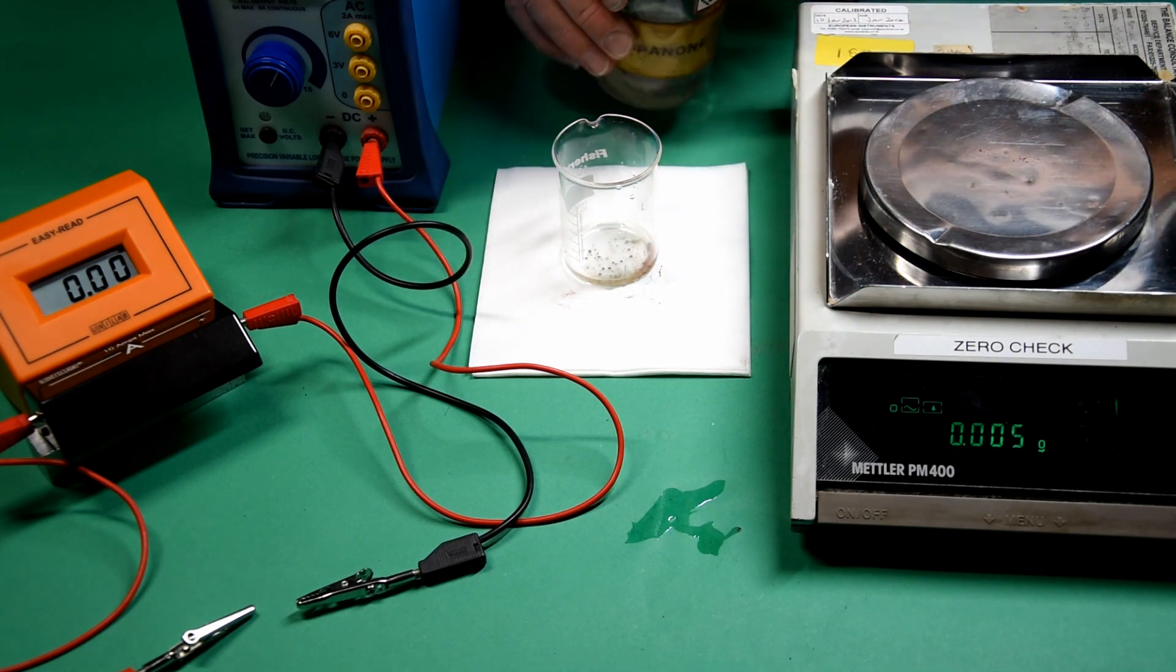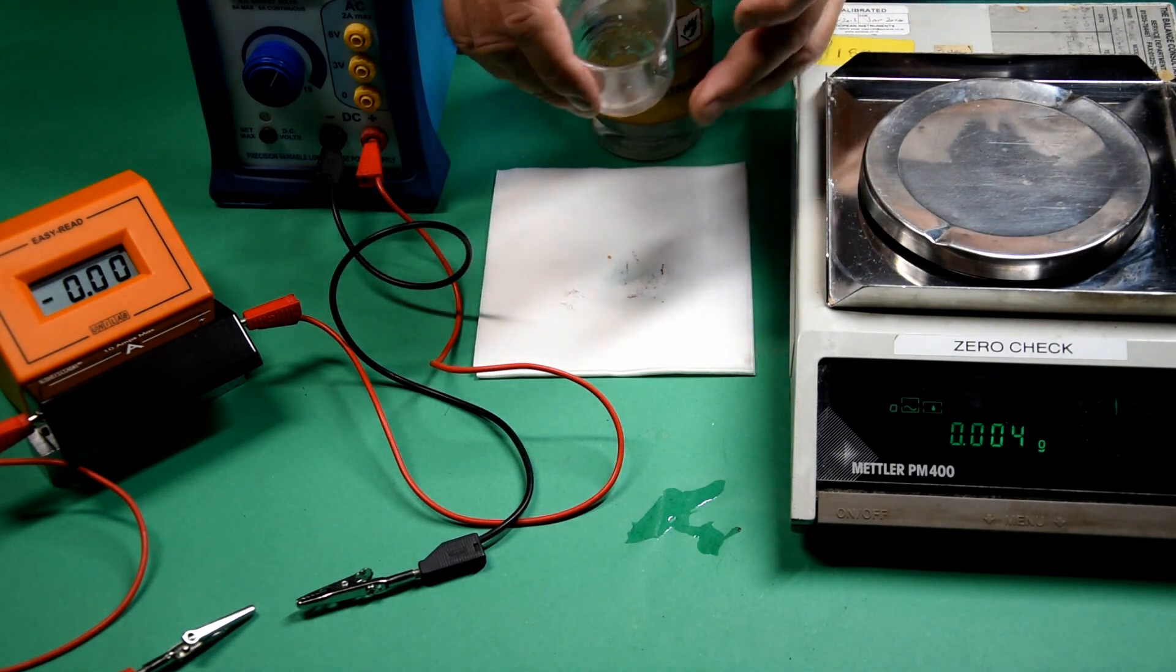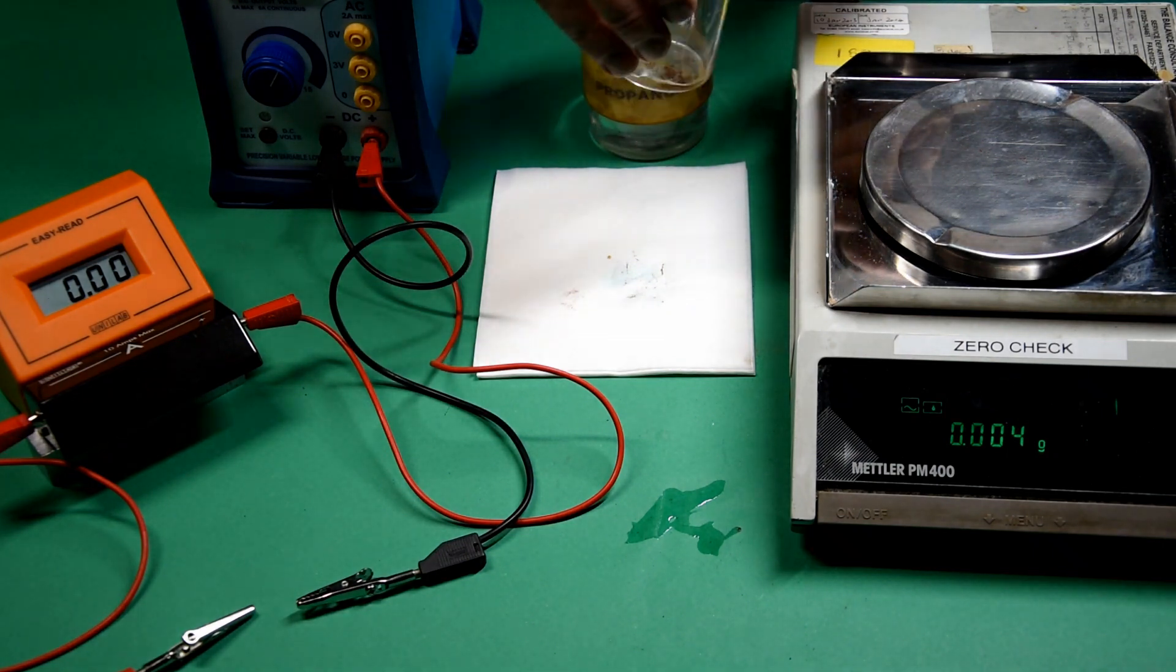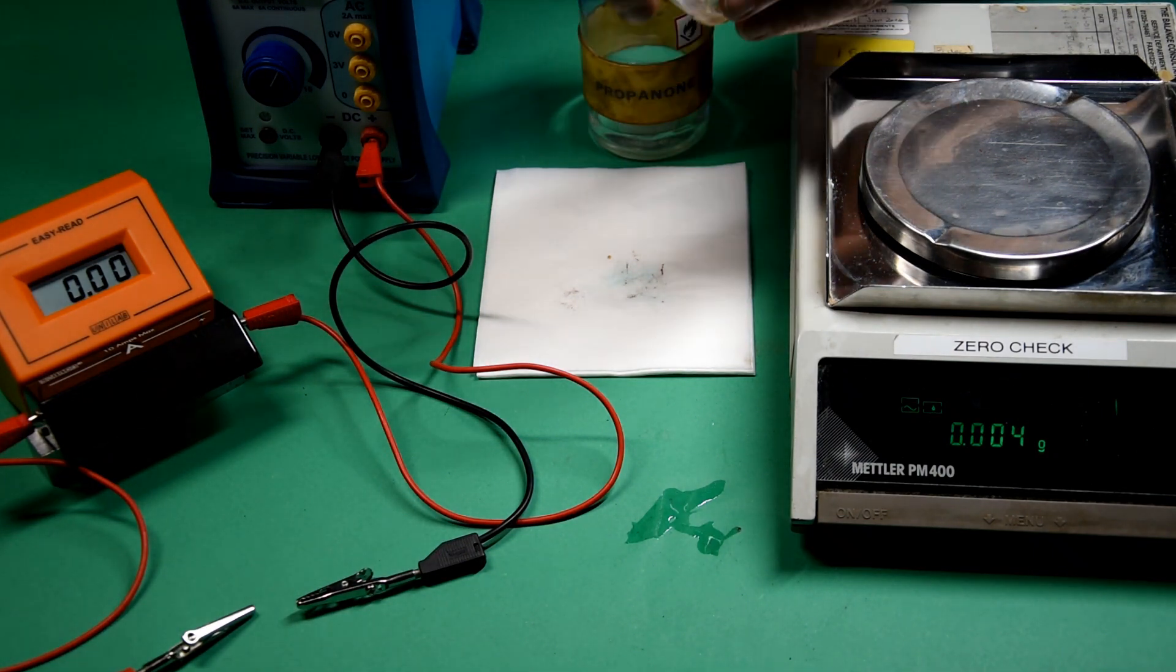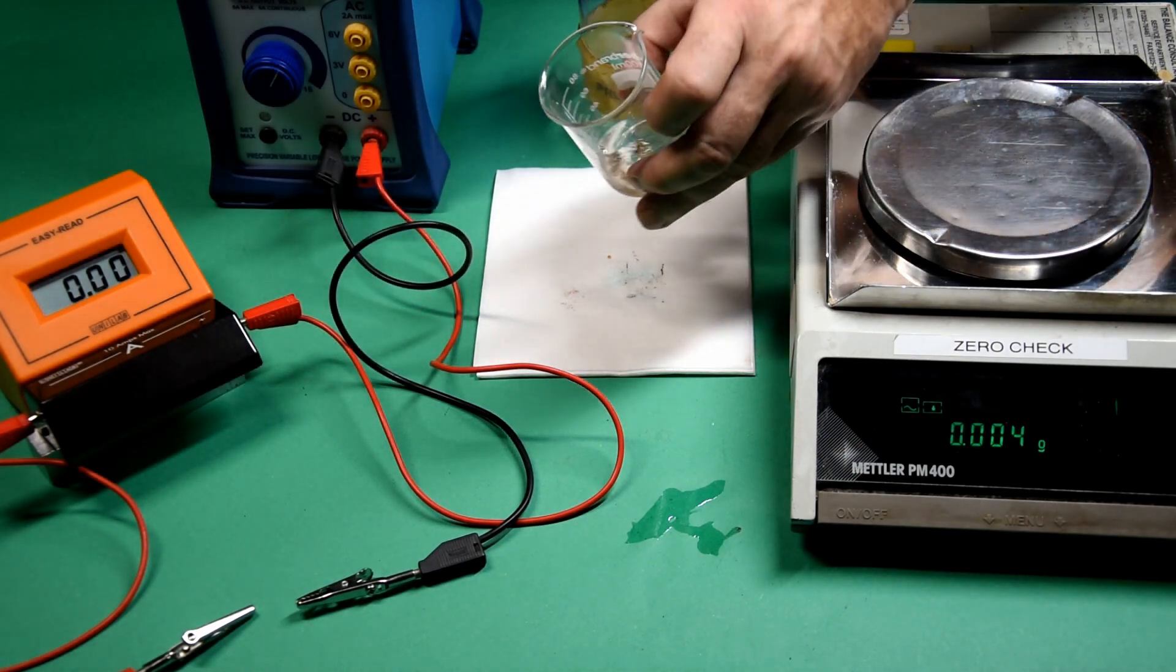Unfortunately, there's rather a lot of sludge left at the bottom of the beaker. Most of this sludge will be copper, but there may be some impurities as well. We're using the propanone to dry the sludge, to get it out of the beaker and to dry it.